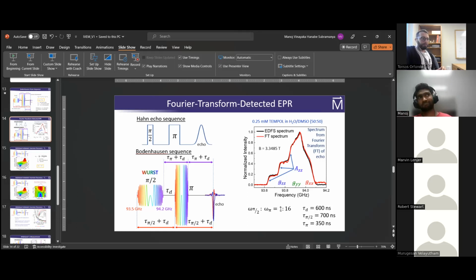The sample tubes we have, it's about 2-3 centimeters, so I would say we fill the tube with 2/3 of it. So it's really not homogeneous because these are like 3 millimeter wavelength. Okay.